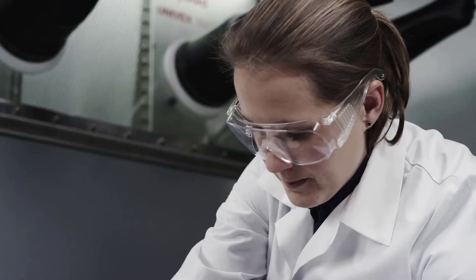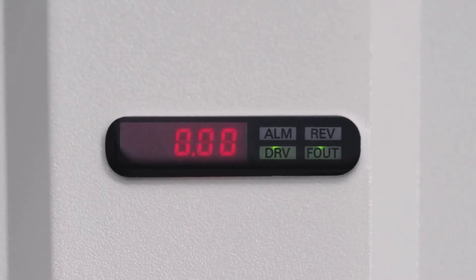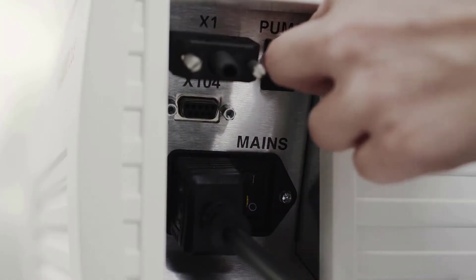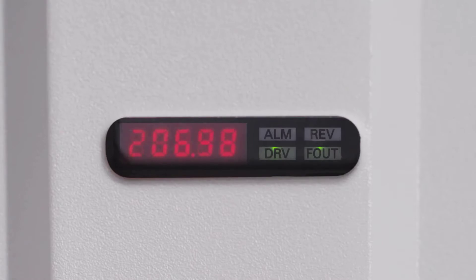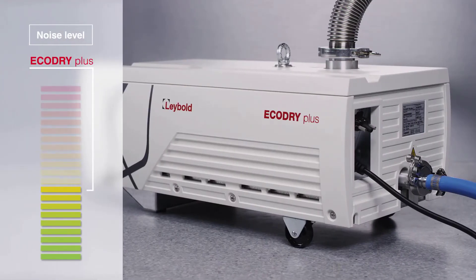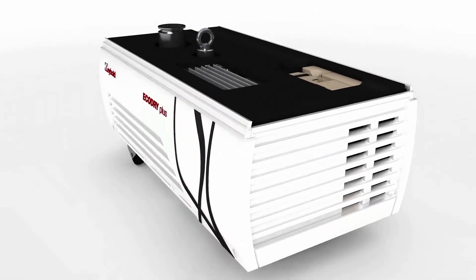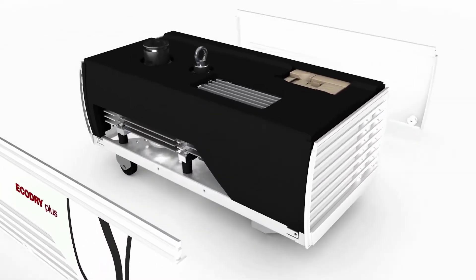With the Eco Dry Plus, you always have everything under control. The integrated display keeps you up to date on the pump status at all times. As soon as you switch the Eco Dry Plus on, you'll notice its comparably low noise level — that is, if you notice it at all. At Leybold, we have made every effort to reduce the noise emissions of each component.